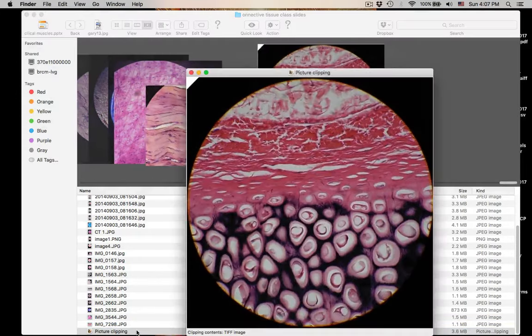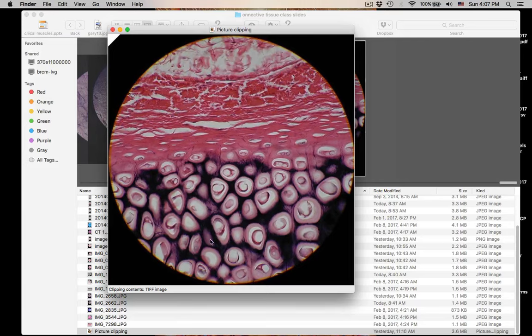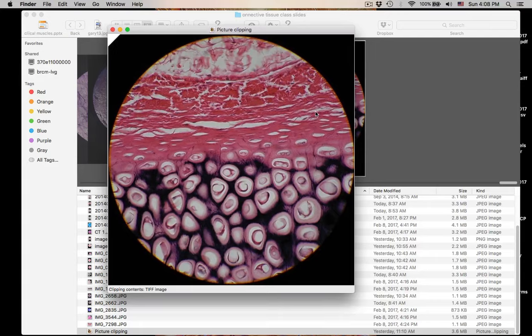I think this is our last one. Name this type of connective tissue — it's down here. What type of protein fibers are in the matrix here? They stain dark — what are those protein fibers? And there's going to be a dense irregular connective tissue surrounding this connective tissue that is bringing it blood. What is this dense irregular connective tissue called that's surrounding it?